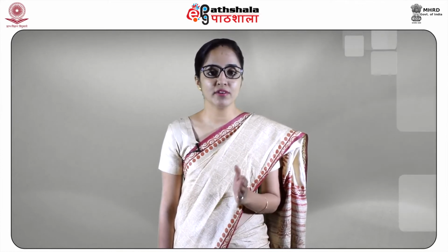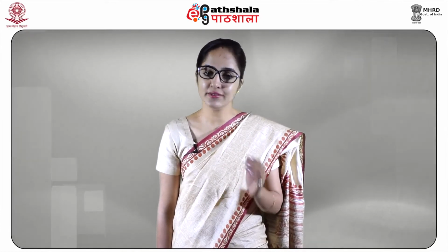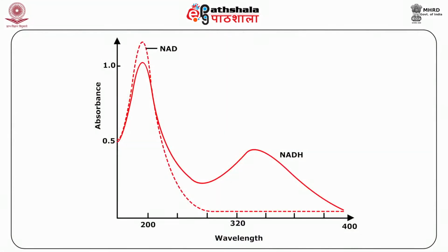Now, not only in industry or to experimental scientists, you can appreciate that UV visible spectrophotometry is very useful even for doctors and in clinical research. The most common reaction used in these clinical assays, as explained above, is the reduction of nicotinamide adenine dinucleotide, or NAD for short, to NADH2.